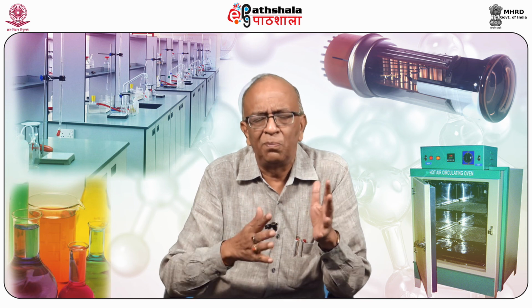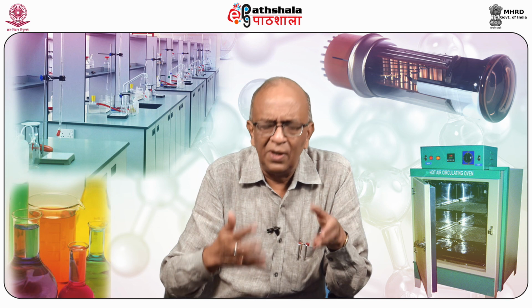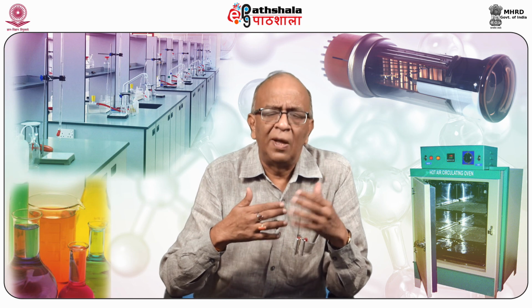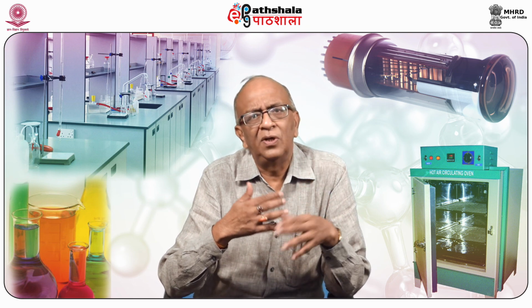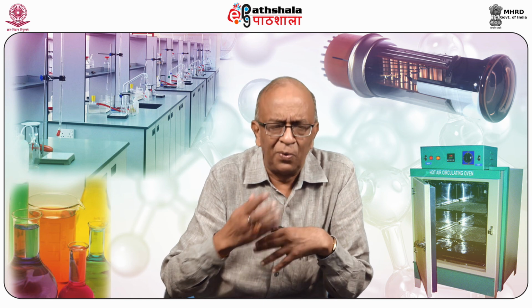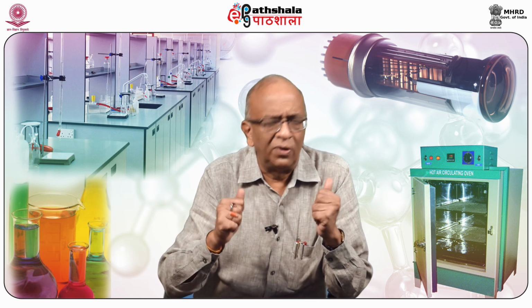But here the stability of the liquid is very important in gas-liquid chromatography. A solvent should be selected which is stable at the temperature at which the components of the mixture vaporize or are volatile. The nature of the solvent should not change.